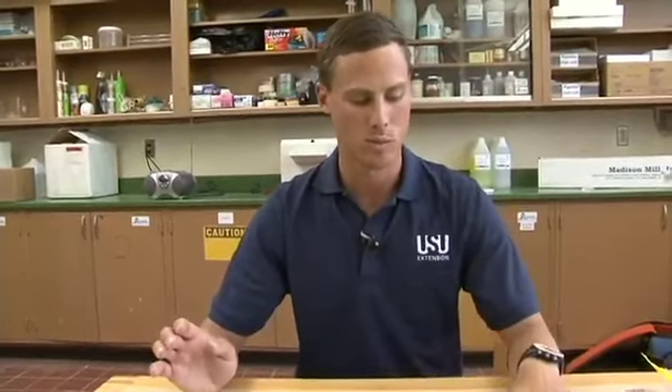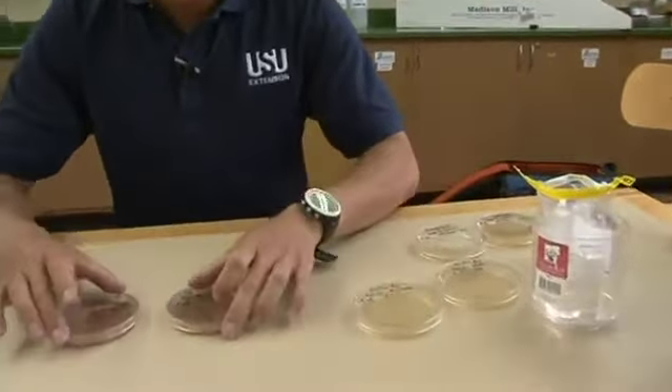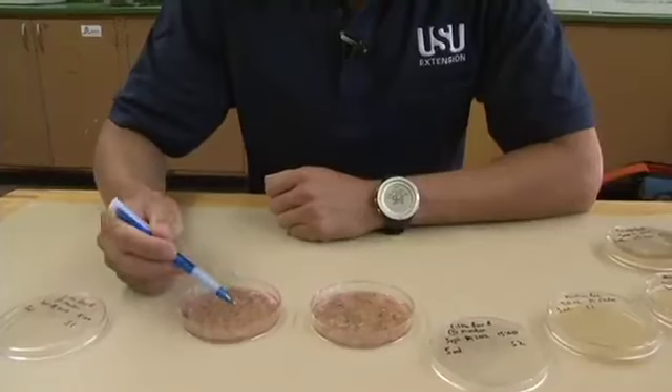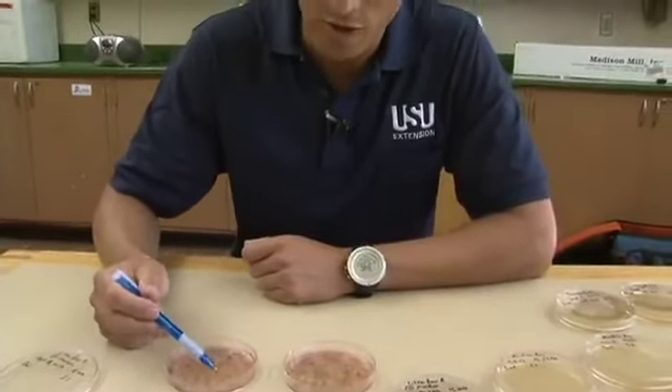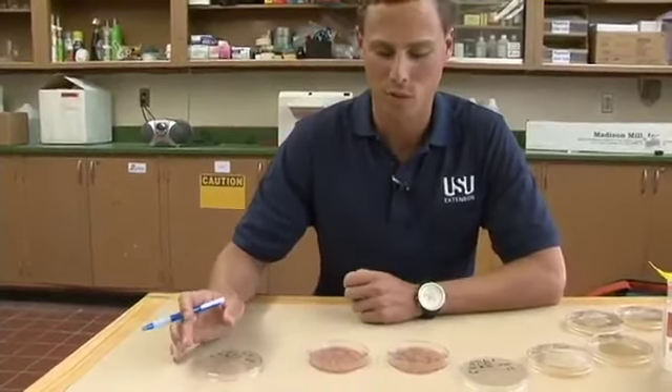If your house is towards the colder side of room temperature it may take longer than 48 hours. Generally this test takes somewhere between 48 to 60 hours. We never want to let this test go longer than 72 hours, because after 72 hours the bacteria colonies can just reproduce on the petri dish instead of being an accurate sample of what was in the water. So how do you know when your test is ready to read? Generally we recommend waiting another 24 hours after you start to see the initial flecking. When you open it up, you should see clearly defined colonies with a very strong color and a nice round circular shape. Sometimes you'll get oblong splotches on the surface — those are also an indication that the colonies have had enough time to mature.